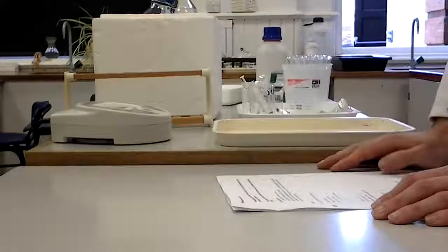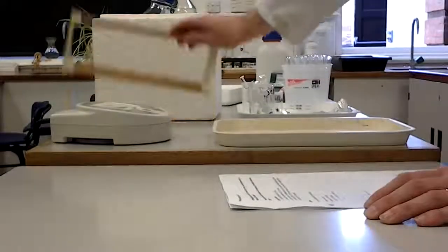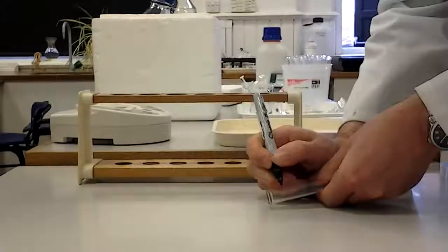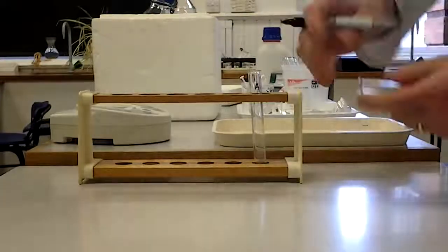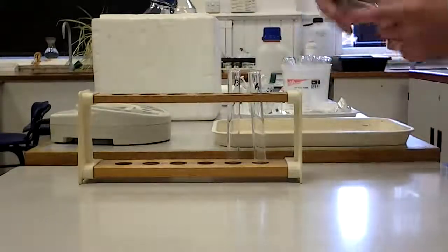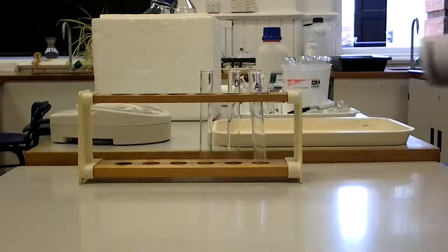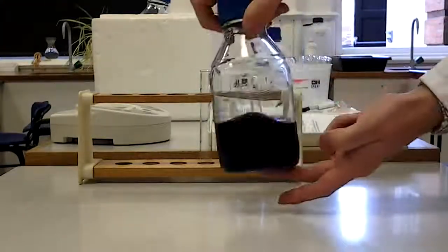Now we have those chloroplasts on ice, happily chilling away. We are going to set up some tubes ready for the experiment. The first thing I'm going to do is set up a couple of control tubes. The first one I'm going to label A, the second B, and the third C. Notice I'm putting the labels at the top — you'll see why in a moment when we come to use the colorimeter. These three tubes are going to play a role in our experiments that will become clear particularly towards the end. First things first, I'm going to need the DC-PIP. There it is — it is blue; it is a dye. Lab coat on whilst you are doing this.